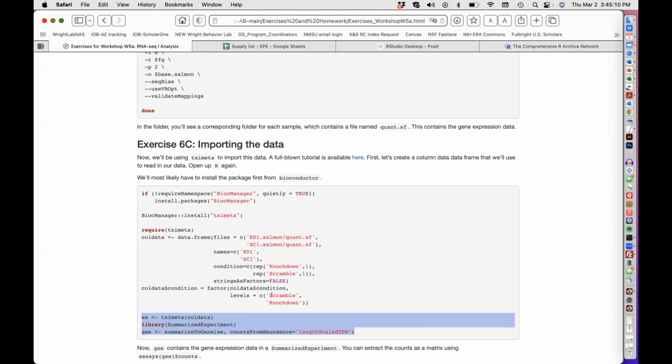In R, if you define something as a factor and then run a regression, it's going to treat it as a categorical variable, with a certain reference, as opposed to a character variable that turns into numbers and isn't interpreted the same way.